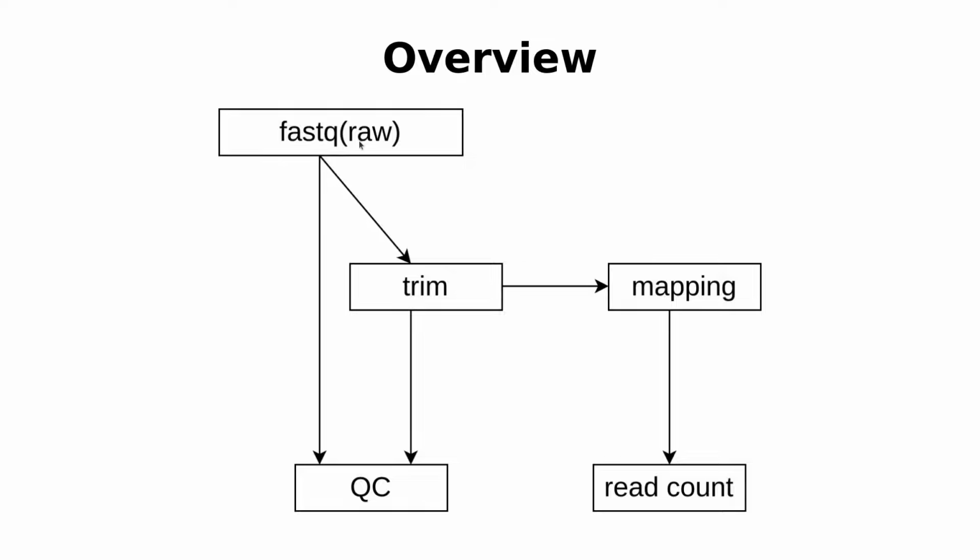But in some situations, you can still use the raw files themselves and then do the mapping and then do your read counts. So it depends on what you want to do. You should always consult your informatician to help you design a workflow. Alternatively, in some institutions, they already have a working pipeline, so they just go by those steps and that's fine. So that's what you need to know.